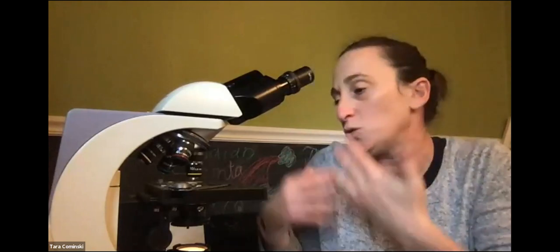All right, guys. The bottom of page 22, the field of view exercise, we're going to skip, okay? But I did just tell you about field of view. We should understand that. Field of view means what you see when you look under the microscope. The field of view is much larger when you're under scanning, under lower power.